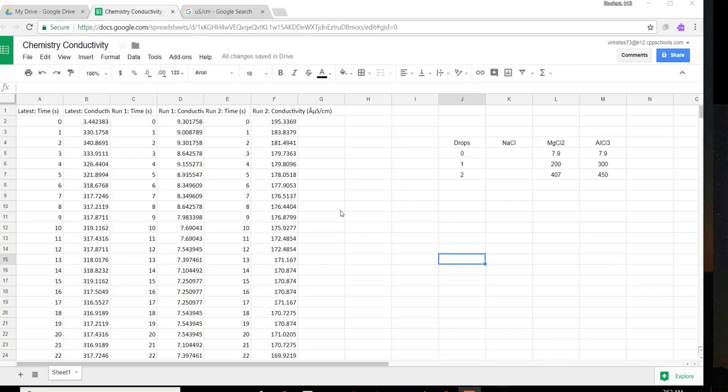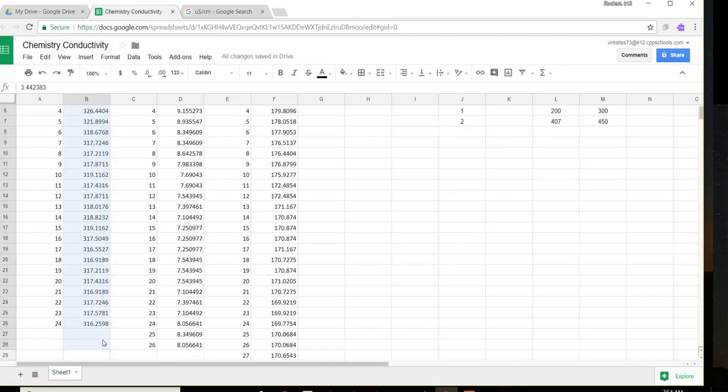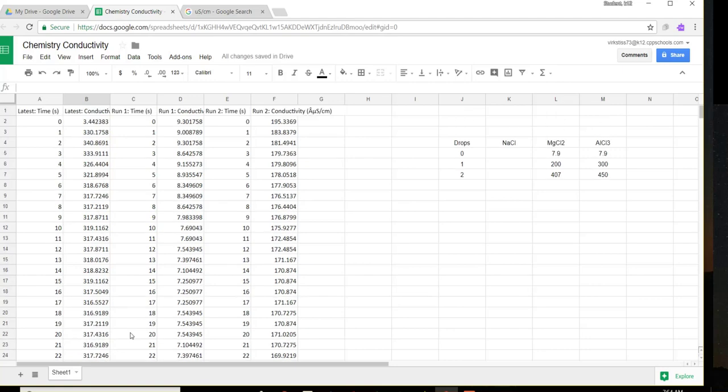To do that, very simply put, you can highlight the column and then take an average. You can do that by going over here where it says functions, clicking on average, then clicking right below it, and it's going to give you the average here. Now I'm going to undo this so we can talk about something.